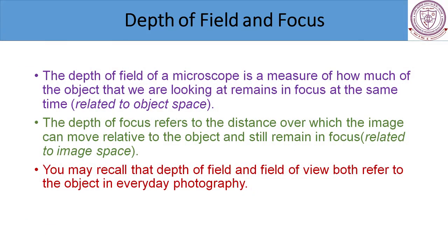So having explained depth of field, now I'm going to talk to you about depth of focus. Depth of focus refers to the distance over which the image can move relative to the object and still remain in focus. So how are you going to understand it? Depth of field is in the object space. Depth of focus is in the image space.